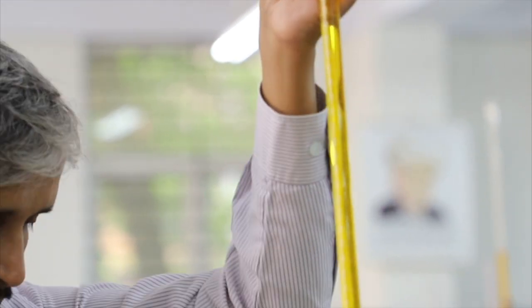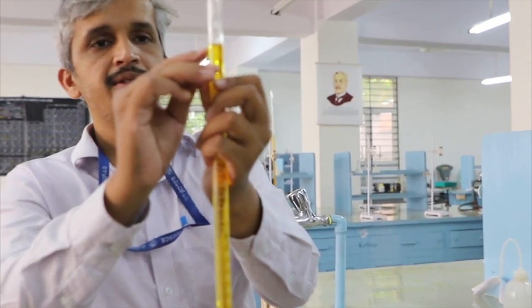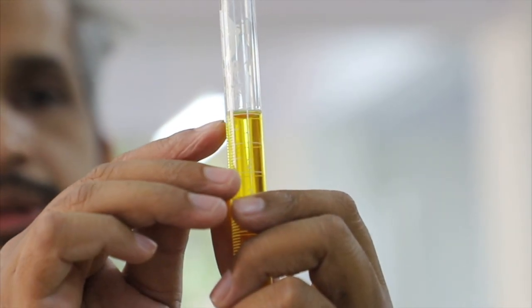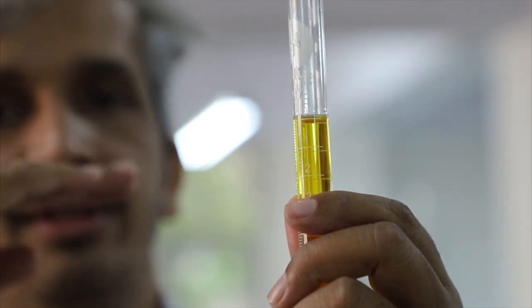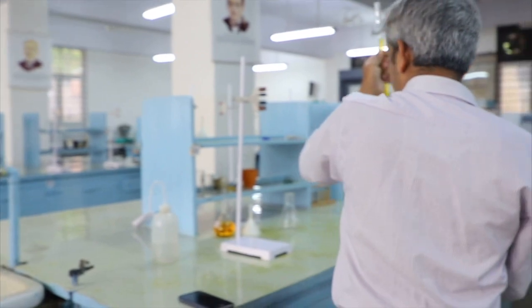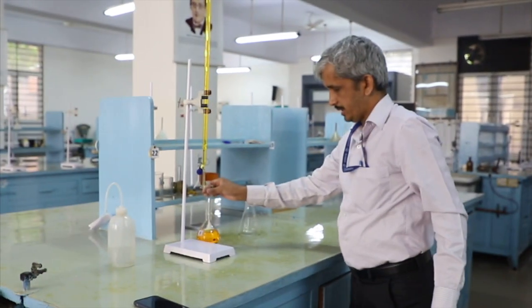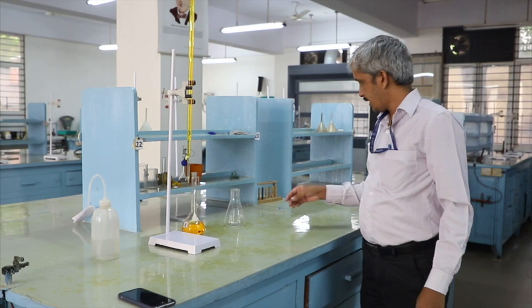As in the previous case, the lower meniscus should be exactly coinciding with this 0 ml mark. The lower meniscus of the solution should be exactly coinciding with the 0 ml mark, and while reading it should be at your eye level to avoid any parallax error. So this is about the buret, and also you have seen how to wash and use a standard flask, how to prepare solution in the standard flask.